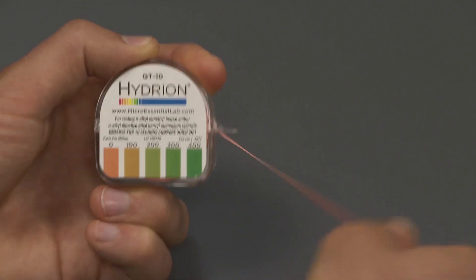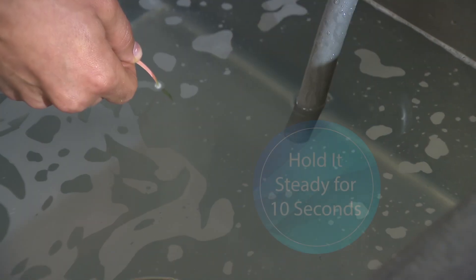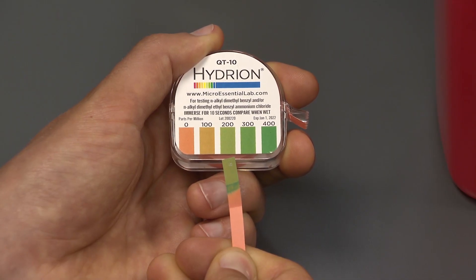Tear off 2 inches of test paper and dip the strip into the sanitizing solution. Hold it steady for 10 seconds, then remove it and compare it to the kit's color chart. If there are darker bands, use the dominant color for matching.